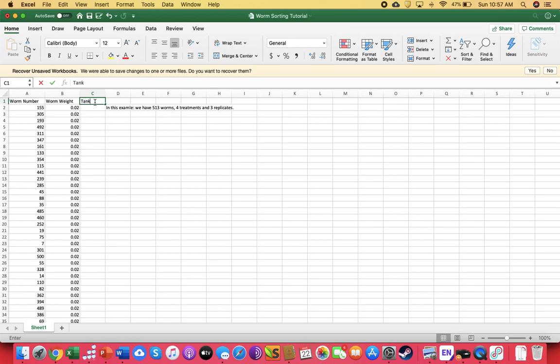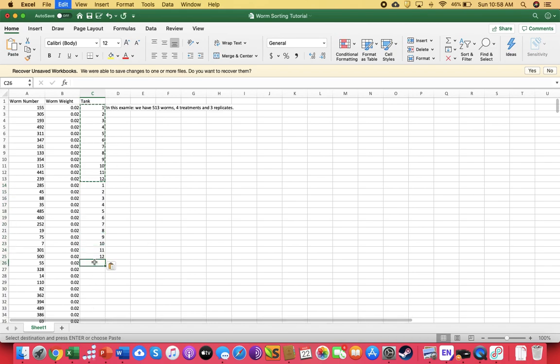So the next thing we're going to do is put them in a tank. Now remember, we have 12 tanks. So we're going to do 1, 2, 3, 4, 5, 6, 7, 8, 9, 10, 11, and 12. All right. Now I haven't taken the time and effort to figure out if this is going to work out slick or not. We might have too many or too few worms. We might not land exactly on 12. I'm not going to worry about it at this point.